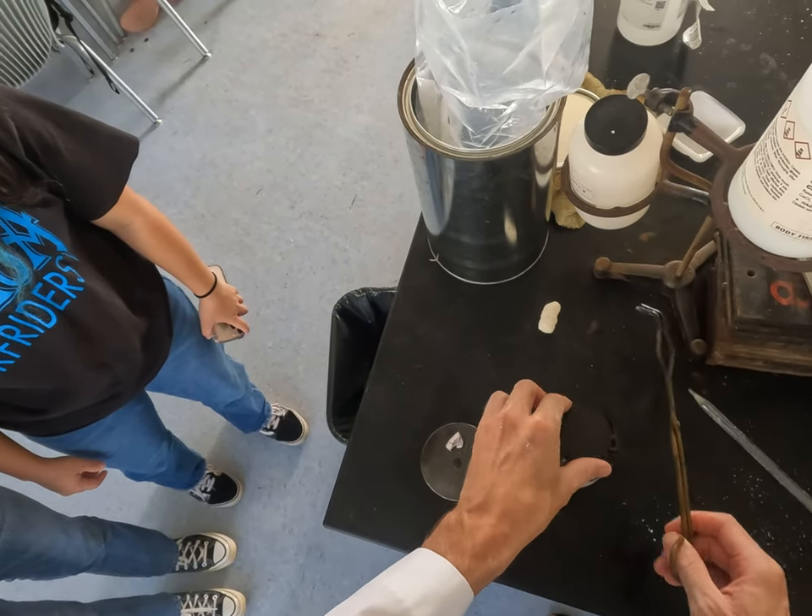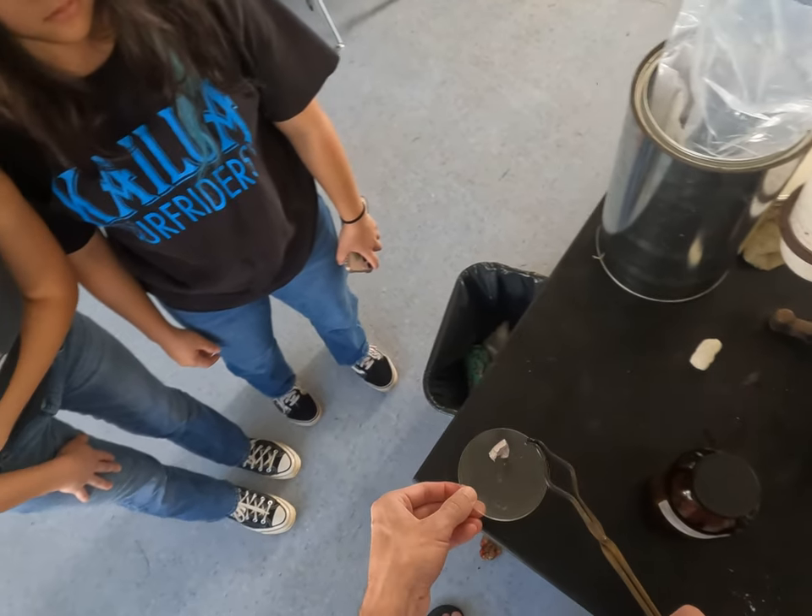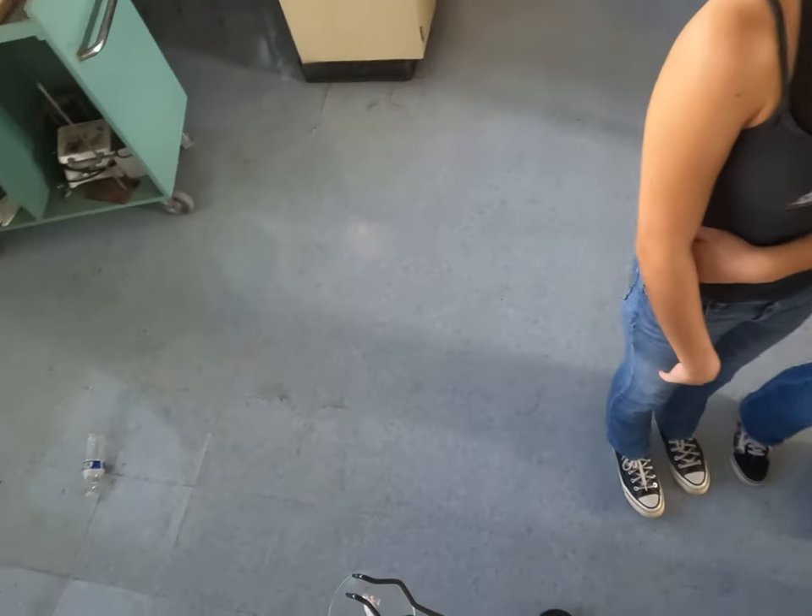What do you smell, though? It doesn't really smell like anything. Don't — you shouldn't — that's not good lab practice.